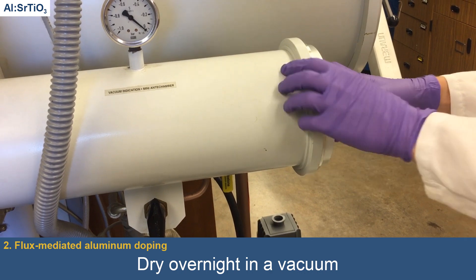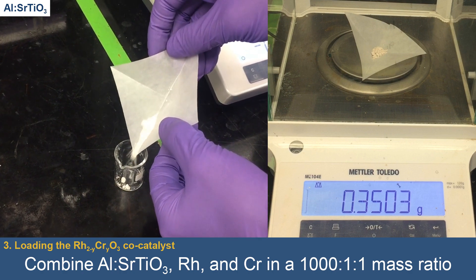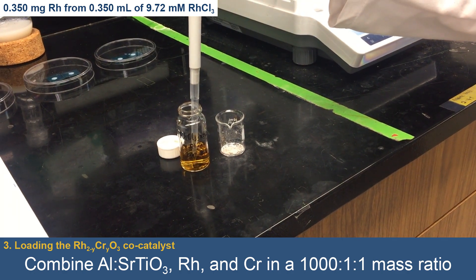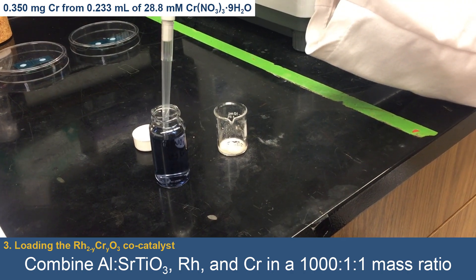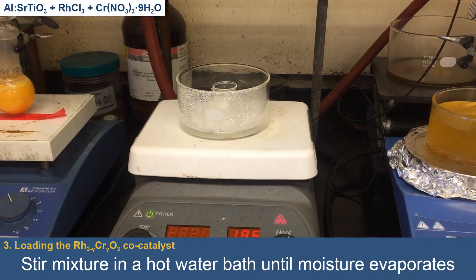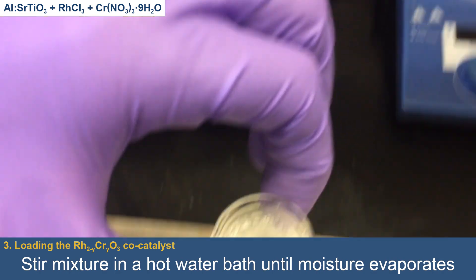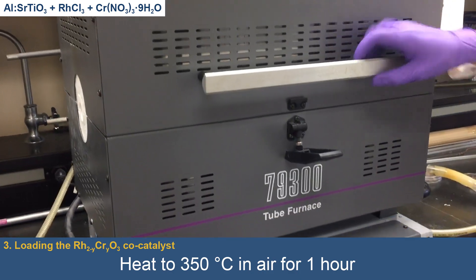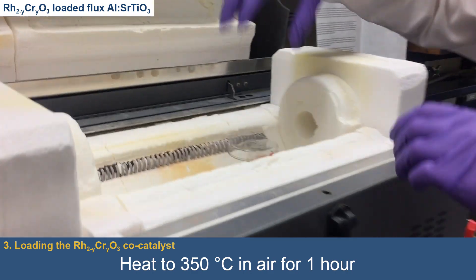Lastly, the rhodium-chromium oxide co-catalyst must be loaded onto the aluminum-doped strontium-titanate microparticles. Rhodium and chromium are both to be loaded at 0.1% by mass, and in the case of this synthesis, rhodium and chromium will come in the forms of rhodium chloride and chromium nitrate nanohydrate solutions. With a few additional drops of water, the powder and co-catalyst mixture is placed in a hot water bath where it is slowly stirred with a pipette until it is mostly dry. Still in the small beaker, the mixture is heated to 350 degrees Celsius for one hour in a tube furnace. This produces the desired rhodium-chromium oxide-loaded flux-aluminum-doped strontium-titanate microparticles.